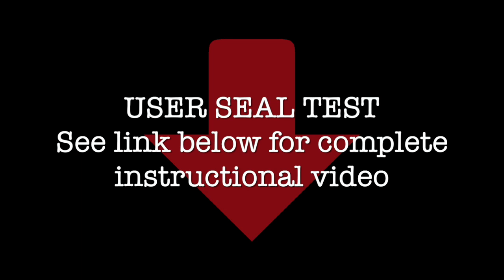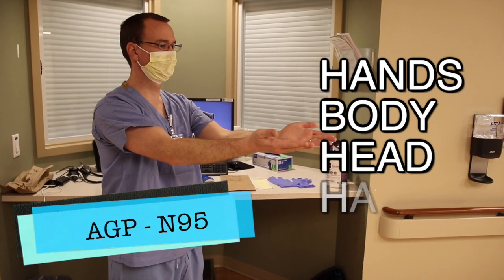If any air has escaped in or out of the mask during this user seal check, you may need to adjust the mask. If continued adjustments do not work, you may need to switch to a PAPR device. Please see below in the video's description for a complete instructional video from OSHA on how to perform a user seal test. Similar to before, we have the same order of operations.